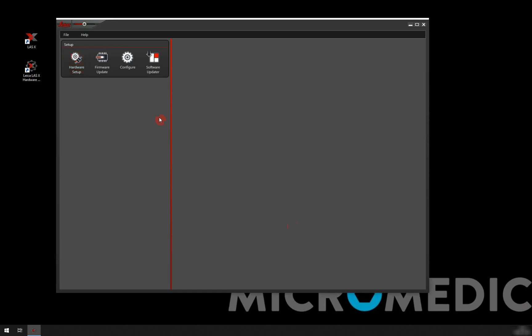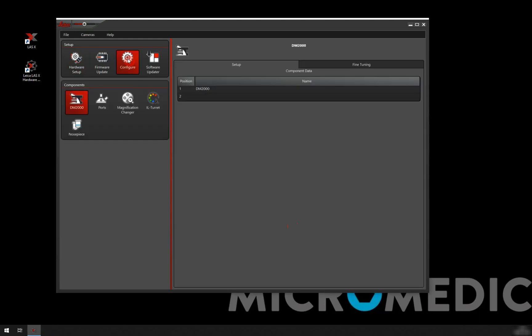I told the software that we have a DM2000. Right now we're going to go into the configure part. This is where we configure our microscope and tell the software what components we have. Right now we have our microscope stand, which is the DM2000.